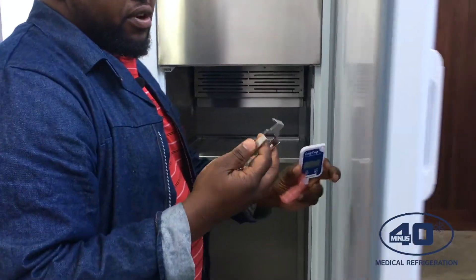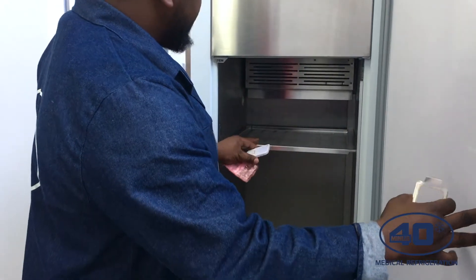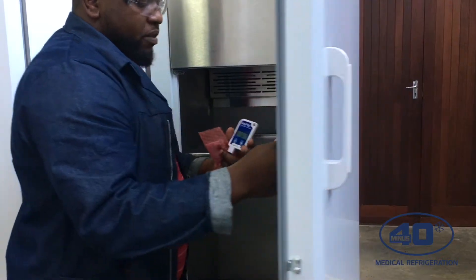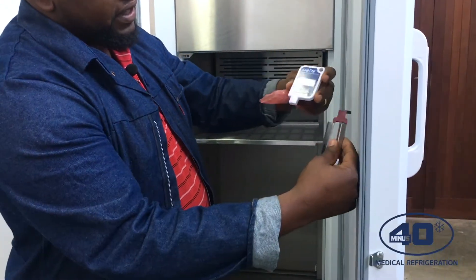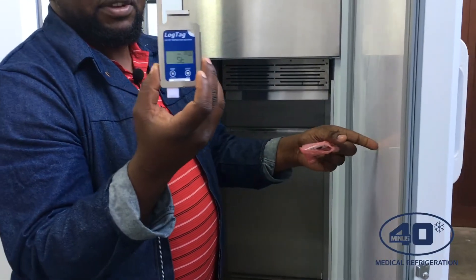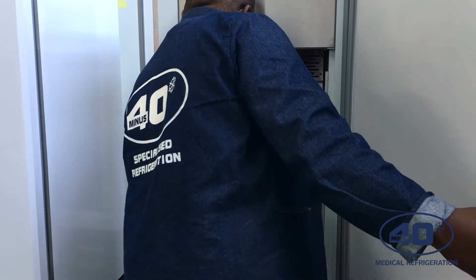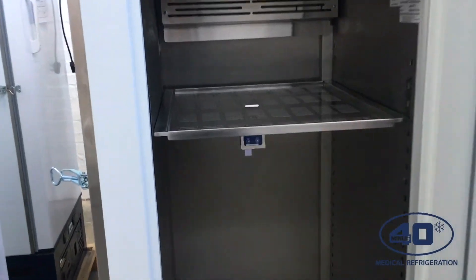We supply the brackets for the LogTag. You just have to use one of the shelves — preferably the middle shelf. Before you clip it, you have to make sure that you put your LogTag inside the bracket. Then you clip it onto the shelf and leave it inside the fridge.